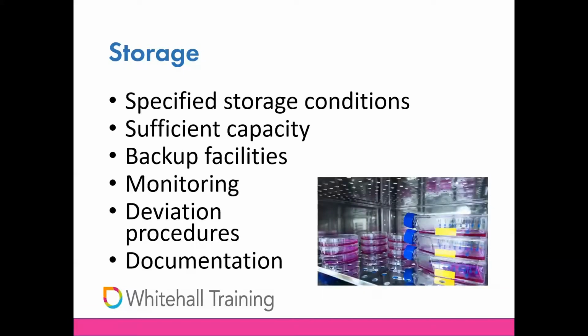So, in terms of storage, all clinical samples need to be stored under the required temperature and conditions. These need to be specified in writing. This is regardless of whether they're at the investigator's site before shipment or in the lab after receipt. Storage conditions can be specified in the clinical protocol, analytical plan, or other supporting documentation, but in all cases, the storage method for each sample and analysis type must be clearly described.